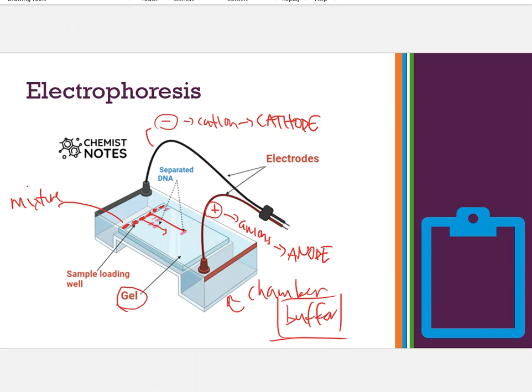This aids in the separation, which is why we're using electrophoresis. It separates mainly based on the size of the fragment. The larger ones typically hang out at the top, and the smaller ones travel through quicker. They're lighter on their feet, and they have a higher speed to go through the gel to reach that red cable down at the very bottom that is positively charged.